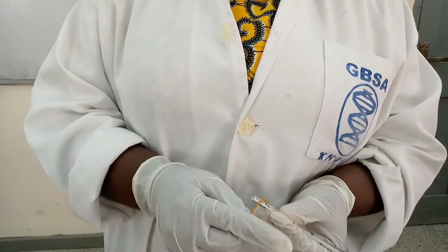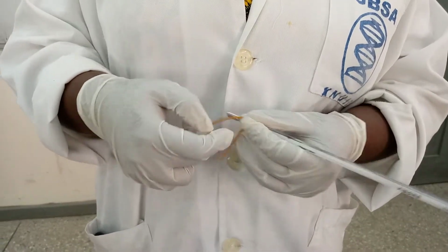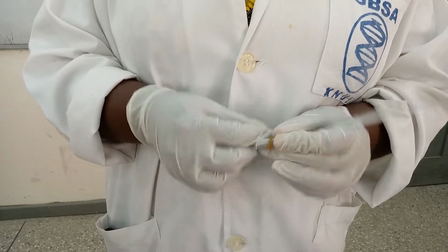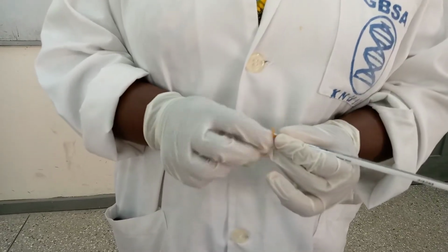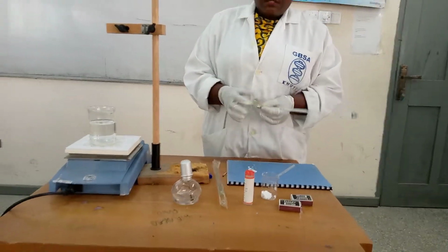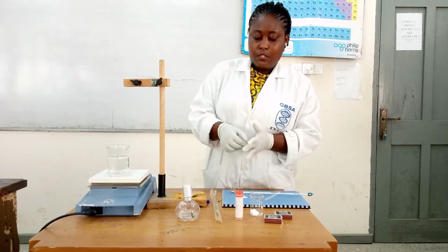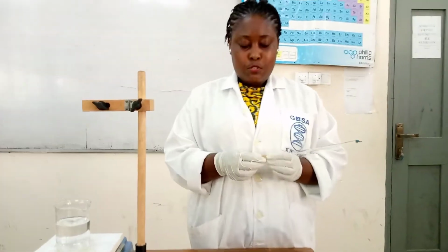You have to be careful so that you don't break the capillary tube, because the tube is very fragile. It's very fragile, so you have to take your time so that you don't break it whilst trying to tie the two together. I need to wear the gloves very well. Pulling it, and I'll continue to tie the two.